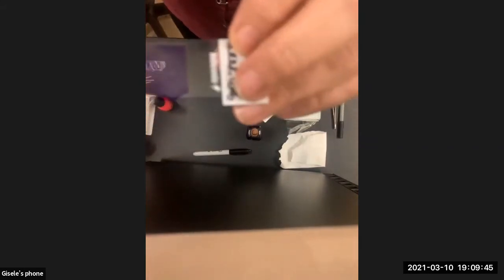And even if you don't, what you want to do next is to seal your slide. I have some lab tape here. If you don't have a nice, easy surface to write on, then you just put some lab tape and then you can still label your slide. Okay, so we use nail polish. One of the advanced students was just telling me how much better it is than the sealants that we get. We can buy expensive sealant for slides, but we don't need to. We use nail polish because it's actually better.